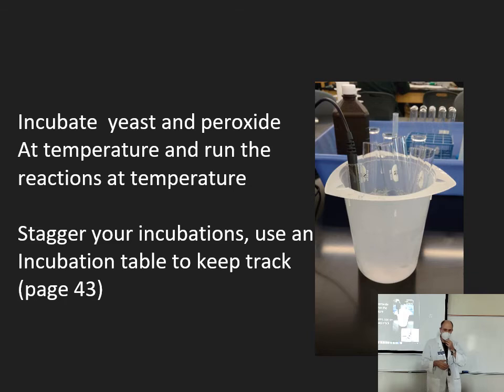Okay? So that's how I envision you doing this, because the problem is if you put all these in at the same time, and then you run these 2, then you run these 2, then you run those 2, by the time you get to the last set, they've been in that ice a lot longer than the first set were. So we're trying to treat everything the same. And the way to help organize that, if you choose to use it, on page 43 is an incubation table.